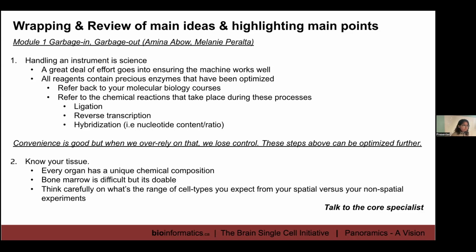So for the garbage in, garbage out module, even though we don't really have a lab practical for that, the whole essence is really to make you understand it all starts with that instrument. It all starts with the tissue. Handling an instrument is also science, and if you think that it's not, then go and talk to Amina. She will let you know. It is science itself. There's a lot of things that they need to learn.